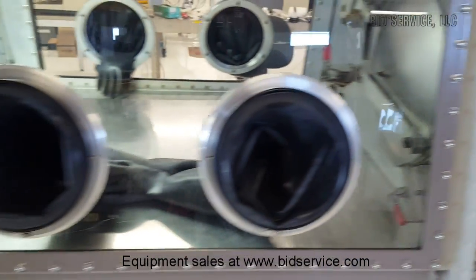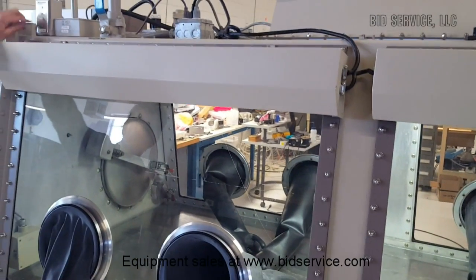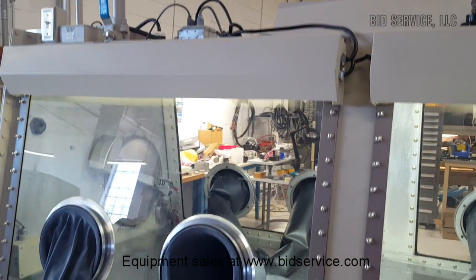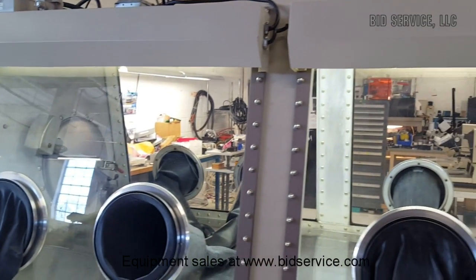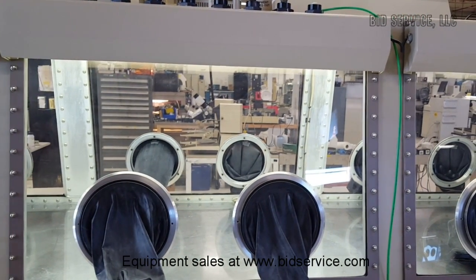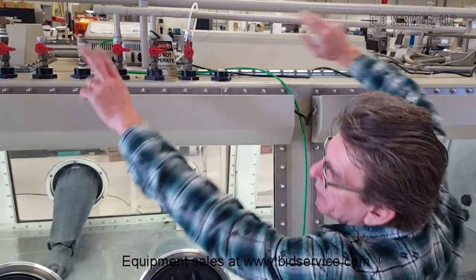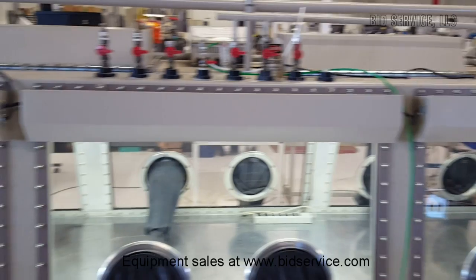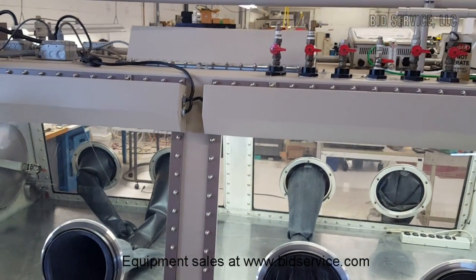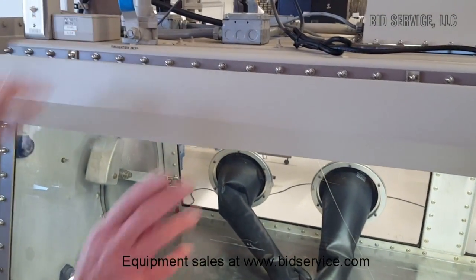We also have a light switch over here — each one of these gives you an interior light. This light switch will turn on the nose lights. The lights up top are always on as long as power is to the system — there's a switch up top for the two upper lights. We have a recirculator valve here you can always close if need be, and there's one on the other side too.